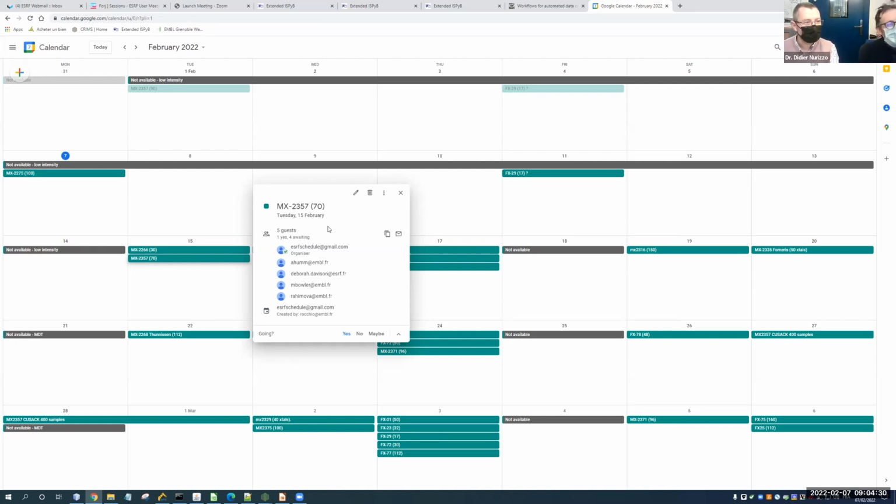If you forget, that's not great, but Debbie, Matt, and I all keep an eye on it, and we notice if something suddenly appears when we try to schedule properly. The number of samples is also not something we need to be very precise about. It just tells us how many samples we'll be able to process during the day.